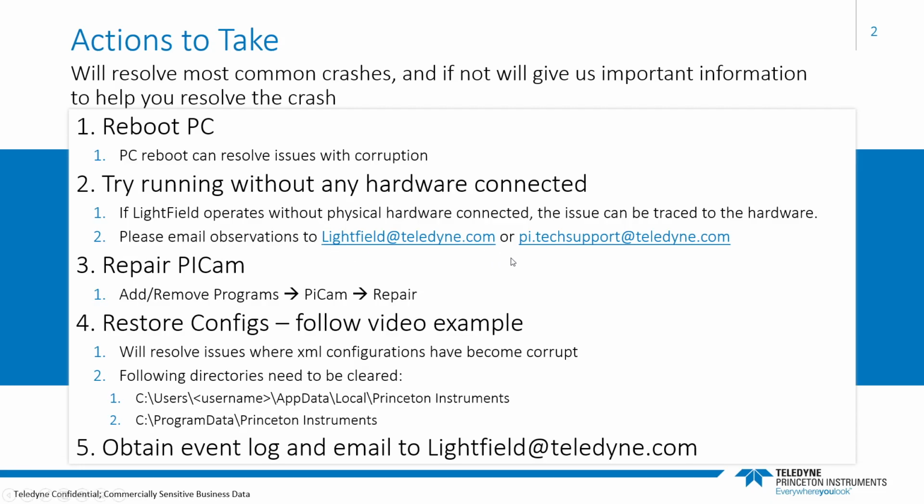So this will go to our software team, or pi.techsupport@teledyne.com, which will go to our support team. Either way, we've got you covered. Someone will get back to you very soon, and we'll help you get up and running. If there's physical hardware causing the issue, then maybe it's a hardware configuration issue or something in the hardware is malfunctioning. We want to get your observations on exactly what's failing and what's not failing, and then we can help you out from there.